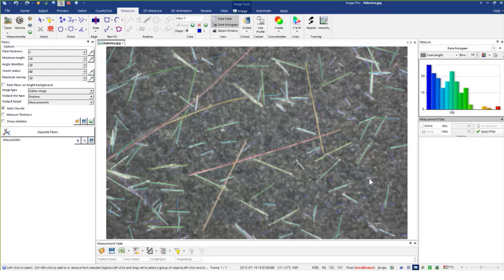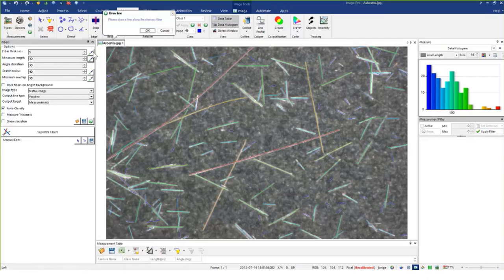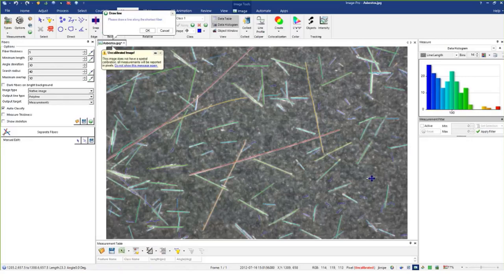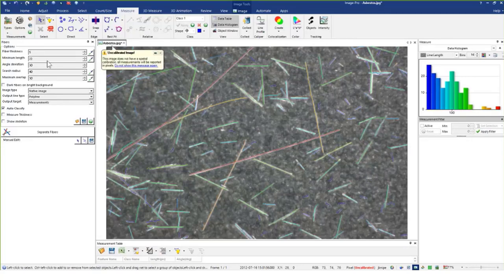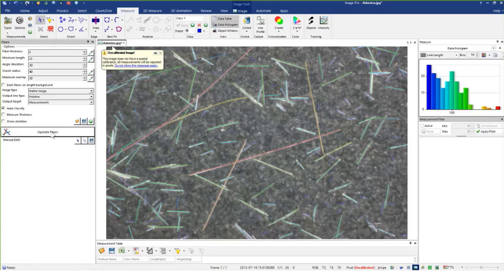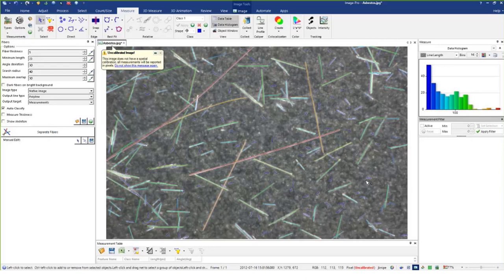Here's a good example — this little fiber looks pretty much like everything else but it wasn't picked up. The question is why. There are one of two reasons: either it's hard to distinguish from the background so the edge detection failed, or possibly one of the parameters is off. In this case I'm going to set my minimum length using the dropper tool — you get a prompt: 'please draw the shortest fiber' — and I define that. The minimum length has changed. Let me rerun the analysis, and now I'm starting to pick that up. These tables are dynamic; I can always select a fiber and delete it if it's not actually a fiber.